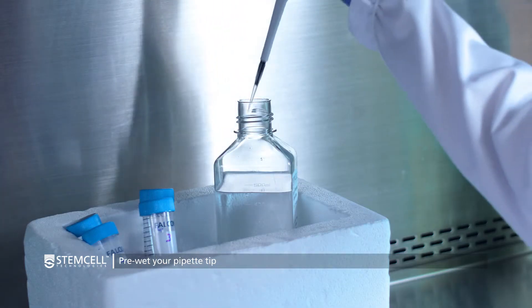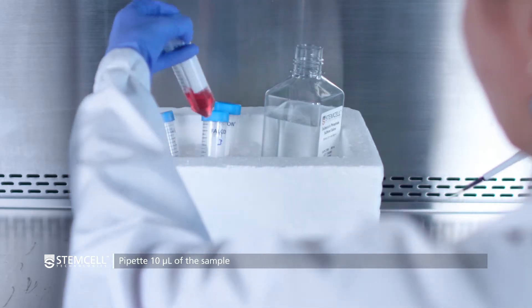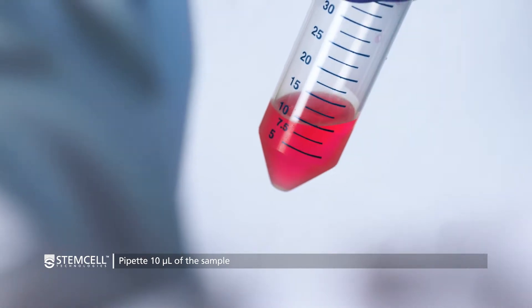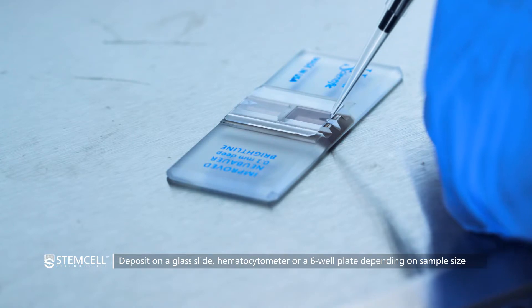First, pre-wet your pipette tip. Then, take a 10 µL sample using a pre-wetted pipette and deposit it on a glass slide, hemocytometer, or a six-well plate depending on the size of your sample.